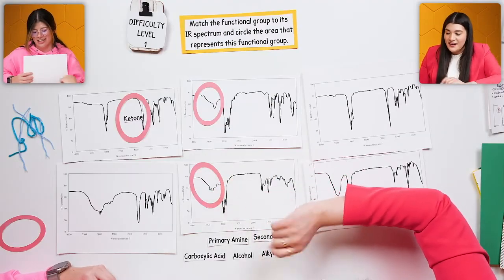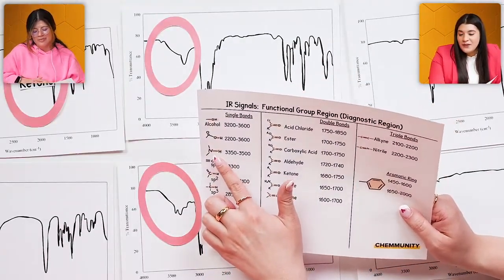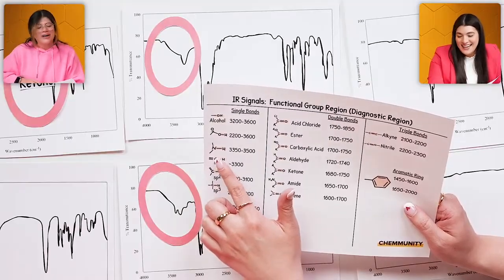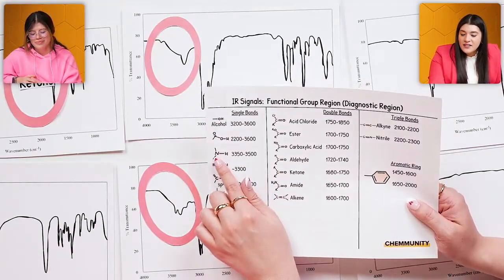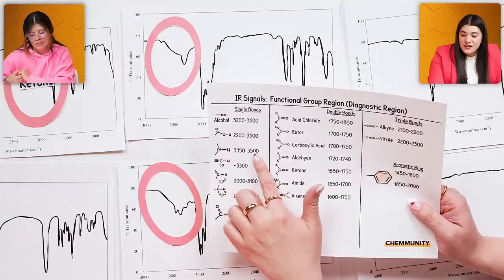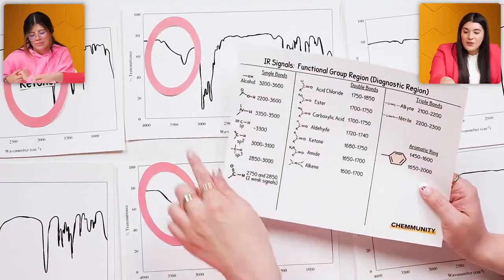But I want you to think back, and if we can look at this, what type of amine is this? Is that just the primary amine? I can't remember. We look at the R groups. Secondary. That's secondary, right. So secondary. Now notice this is highlighted: just the nitrogen connected to the hydrogen tells me that's within this range. There's only one hydrogen there, so there's only going to be one peak.